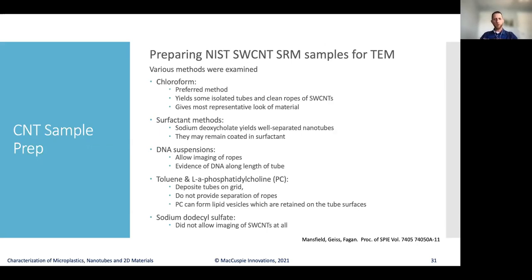And so obviously, the National Institute of Standards and Technology got interested in creating reference materials for carbon nanotubes and successfully created these, a great technical accomplishment and a great boon for industry, making these standard reference materials. One of the key aspects then is to understand how to prepare these samples for TEM analysis and to study the dispersion of these materials. In a recent study, NIST looked at various methods of preparing carbon nanotube materials for TEM and found some really informative and instructive results in their presentation.